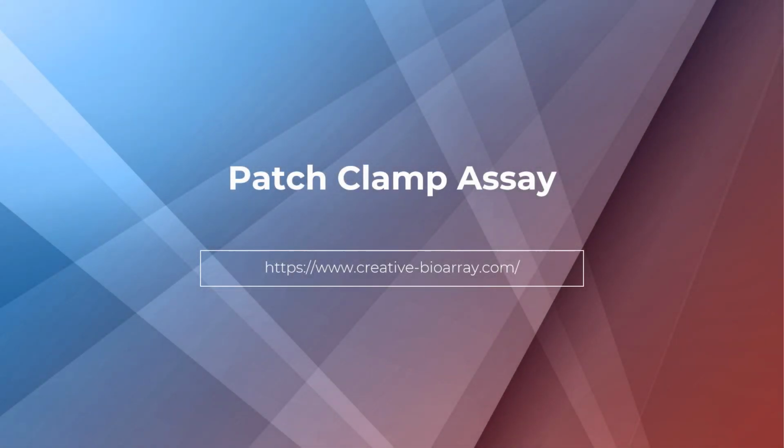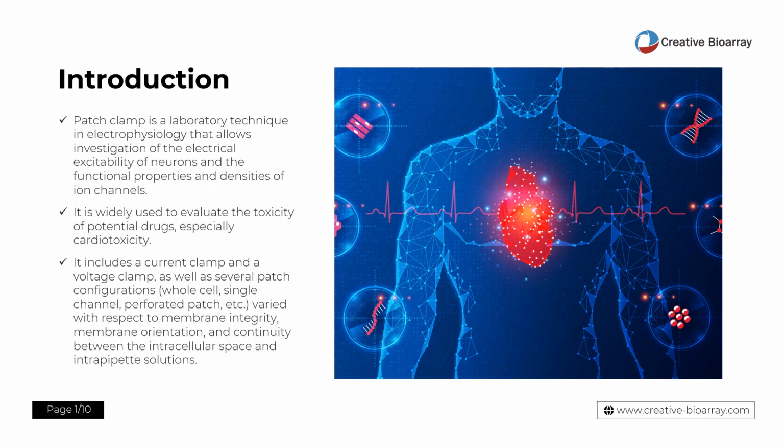It's a detailed step-by-step description of the standard patch clamp protocol. Patch clamp is a laboratory technique in electrophysiology that allows investigation of the electrical excitability of neurons and the functional properties and densities of ion channels. It is widely used to evaluate the toxicity of potential drugs, especially cardiotoxicity.